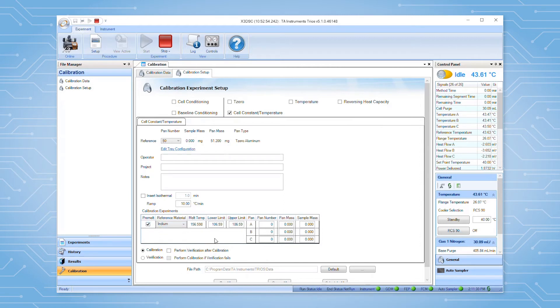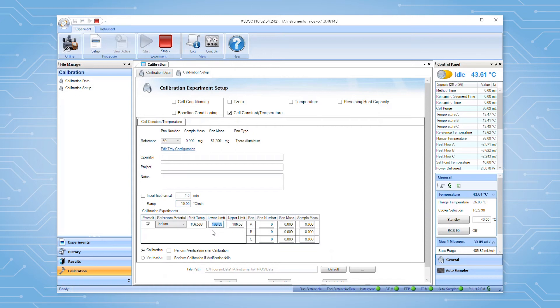The software will determine the lower and upper temperature limits based on the reference material selected and the ramp rate of the experiment. These values can be modified if desired. After selecting the reference material to be used, enter the correct sample information into the table.